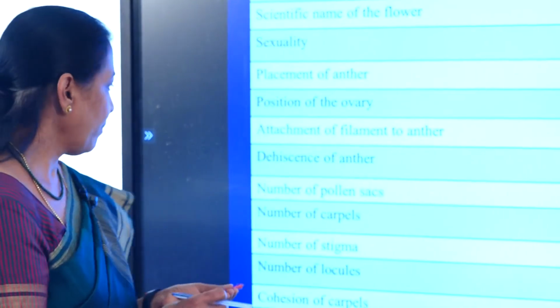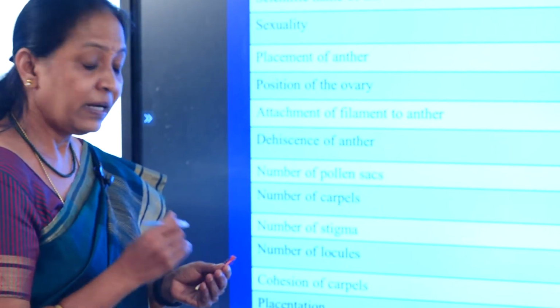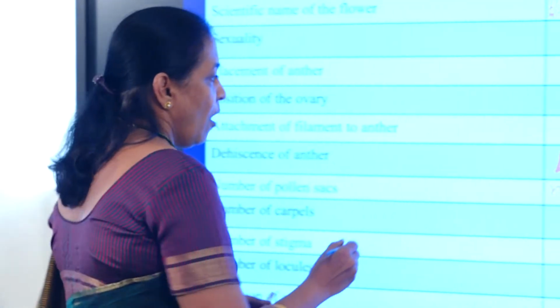The number of carpels. Now how many carpels are there, we are going to see this. The number of carpels here it is 5.